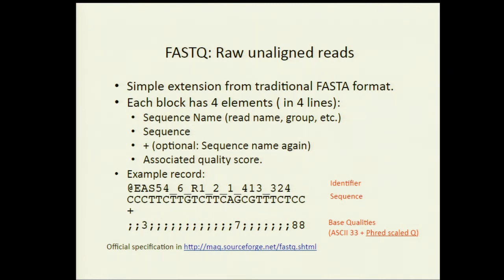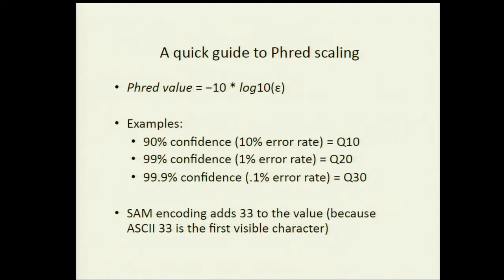Okay? So these confidences I talked about are Phred scaled. I've given this presentation once before, and people had no idea what Phred scaling was, so I'm going to jump in here and explain what the Phred scale is. Almost every presentation we'll talk about later on mentions Phred scaling, Q-scores. So I just want you to understand what it is. This is the actual mathematics: it's negative 10 log 10 of the error rate.